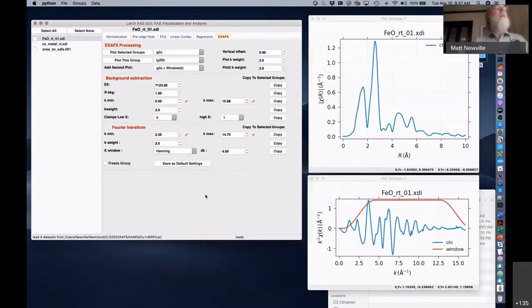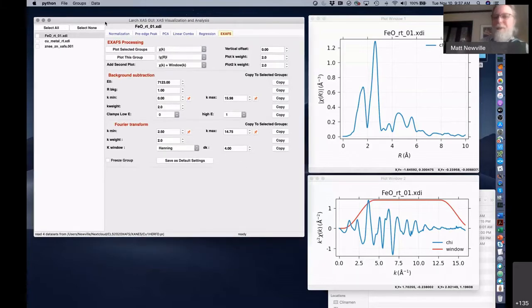I think that's a good place to stop for questions, because then I'm going to switch to a little bit more of Zane's data processing before a longer break. This is a good time to go over whatever I forgot to mention, or whatever I forgot to cover for Fourier transforms, background subtractions, reading data, processing. Let's take a time for questions, or maybe a mini break.